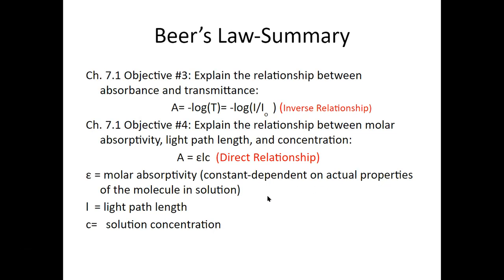It's a constant dependent on actual properties of the molecule itself that's in the solution. And for many years people have been putting together this lab that, for the last year or two, we haven't done, but it was cute. It was about sunblock and SPF and how you can take an ingredient that's in sunblock and see the activity or effectiveness of different sunblocks using a UV spec, but you would do standards, and it's hard because the sunblock is opaque.